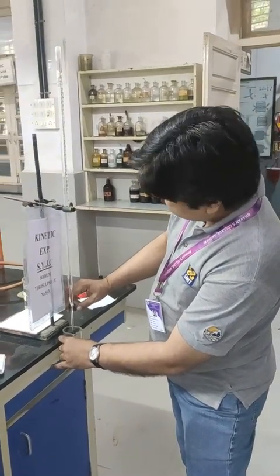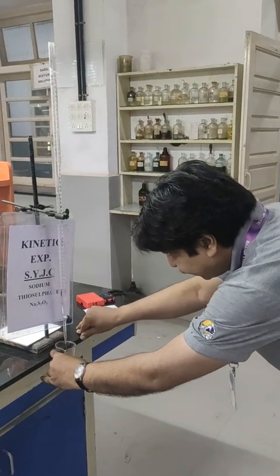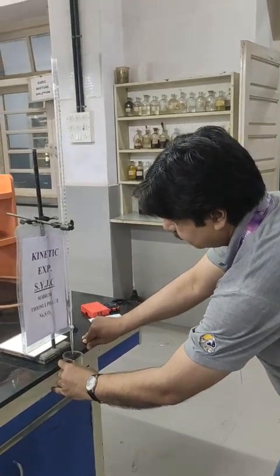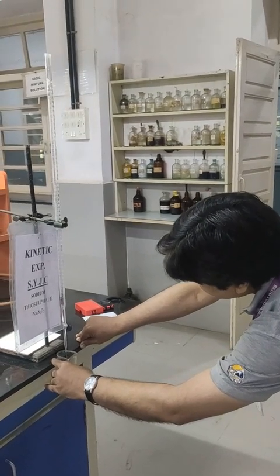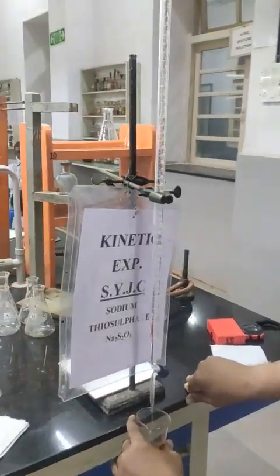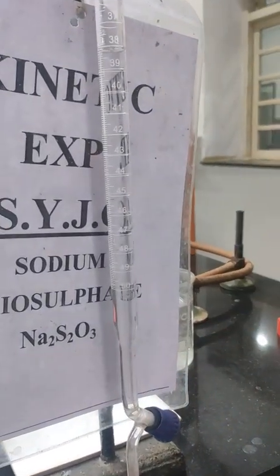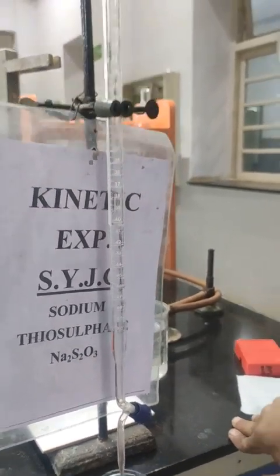I am starting with 20, so I will burette it out when it reaches 50. We are taking 30 ml of sodium thiosulfate.